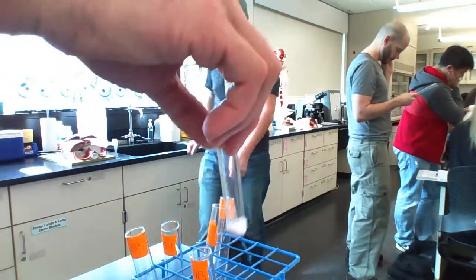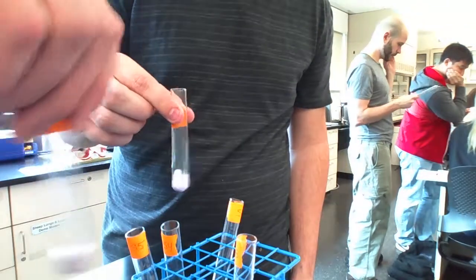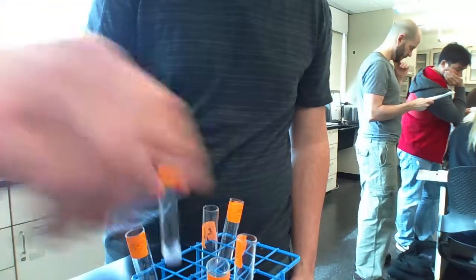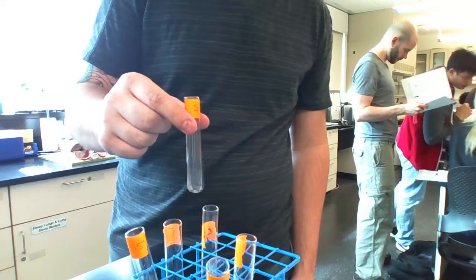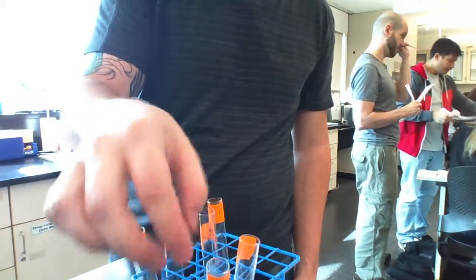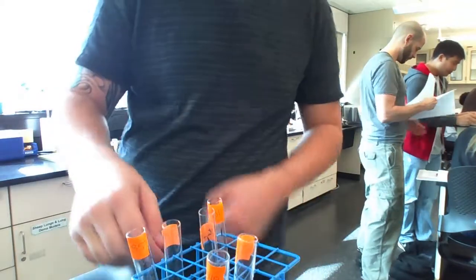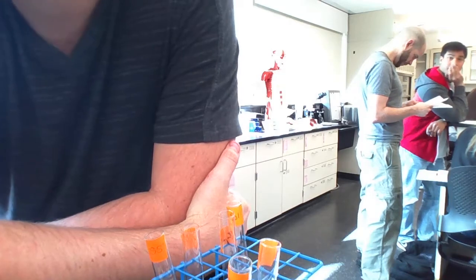So then once we do that, that's when we put them all in this incubator thing for an hour. Is that right? Yeah, besides 5L and 5B, because those get basically frozen. And we're just cycling. And then these are at body temperature. Okay. So what are each of these different things supposed to be simulating? In different steps at different temperatures. Same temperature, so body temperature. So two of them are not at body temperature.